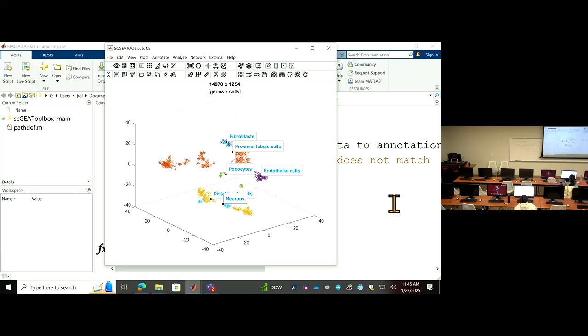How does the software determine how to separate the cells? What point to group cells? What is the scale based off of? It's based on the position or the cluster. That's what we will learn in week 3, in the clustering class, with many options. Machine learning is really good at this. I'll ask you next week. There is some theory behind that, with different options, so we will gradually learn those options.